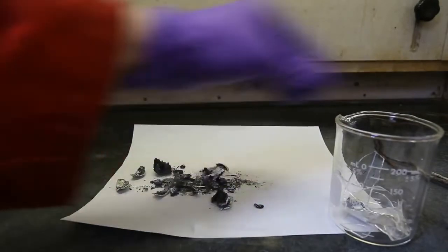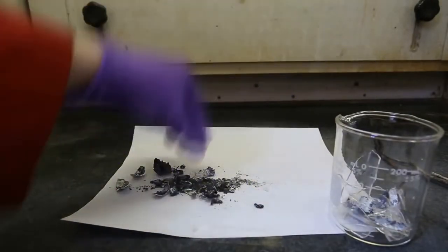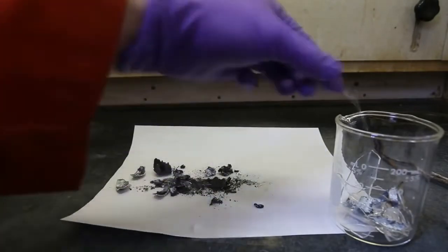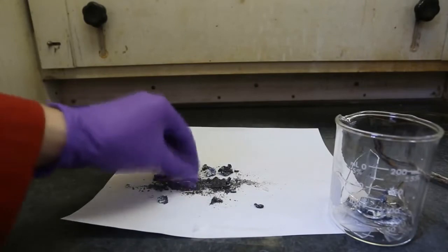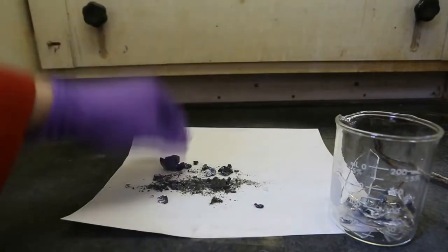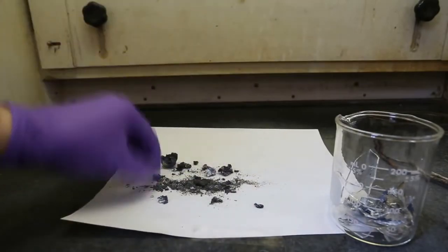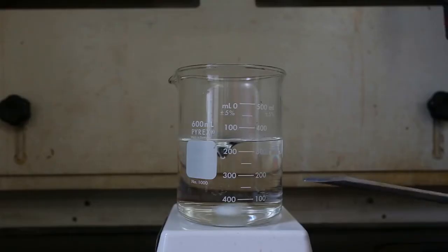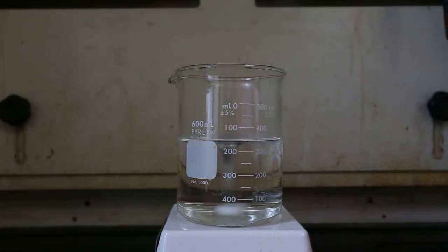However, it isn't nearly pure. It contains a lot of magnesium oxide, magnesium metal, and silicon dioxide that didn't react. Once the glass has been removed, you are ready to test out your magnesium silicide. This can be done by dumping a small amount of your product into a 10% hydrochloric acid solution. Here's just a small test to see that it works. The presence of magnesium silicide is confirmed by crackling noises and flames.